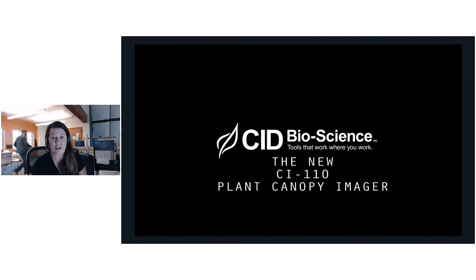It comes with 2 sets of rechargeable batteries for a full day in the field. The battery charger also includes a car adapter, so if you happen to be out in the field with access to a vehicle, you can use your vehicle to charge the batteries as well. What I'd like to do now is play a very short video of the CI-110 plant canopy imager, and then we will move on to our live demonstration.